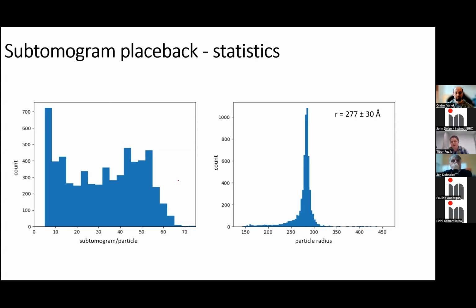It's very hard to study it in vitro because if you lower the pH with the mature particles, then these particles start to fuse with each other in all the membranes, and it just makes huge clumps of aggregates, and those are not visible on the microscope. It's completely covering the grid. So far, the other groups were crystallizing it at low pH, and they got a trimeric structure that has a tip, which is formed by three of the fusogenic loops. Yeah, okay, clear.